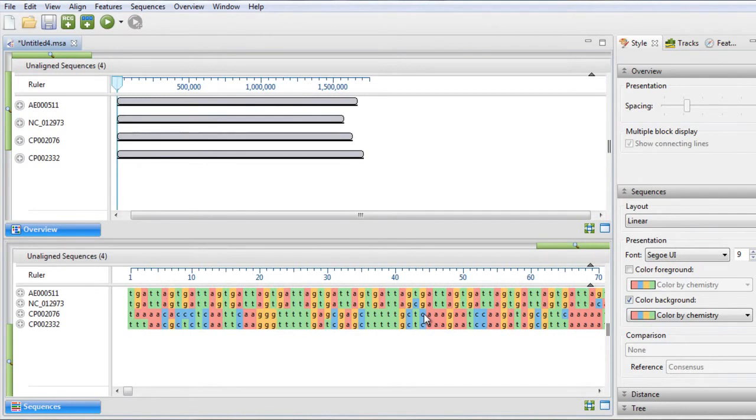After doing so, the sequences appear in the overview as solid gray blocks of unequal length, indicating that the sequences have not yet been aligned.